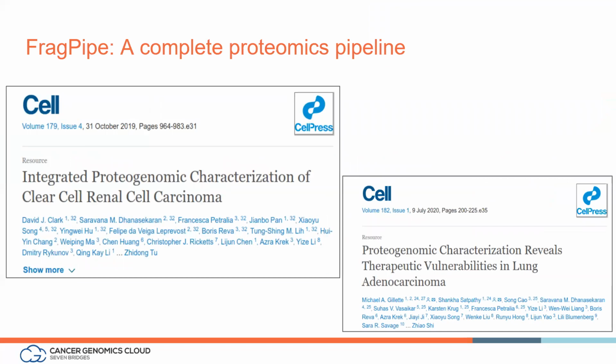Hi, thanks, David. Thanks, Sai, for the introduction. So in the next slides, I'm going to introduce a little bit about the proteomics pipeline that our group has been working on in the past years. What I'm going to show is one of the main and central tools for proteomics data analysis that was featured in a few of the publications from the CPTAC, the third edition of the CPTAC.